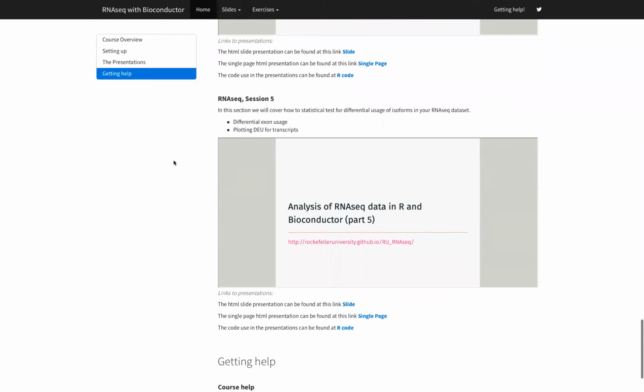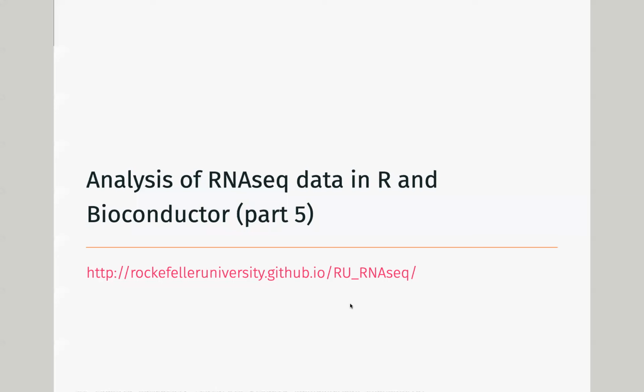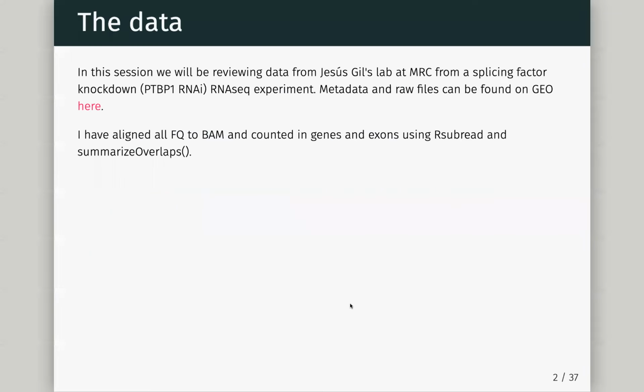For the last session now, we're going to actually go back to exons and transcripts. So we'll try and cover the idea that really gene expression is great, but you can get points where a gene's expression doesn't change, but the transcripts within it do. And that can be an entirely obvious alteration of the function of the gene. You could suddenly be expressing a transcript which does something very different to the original gene's function. And that could really be something very informative about what's going on.